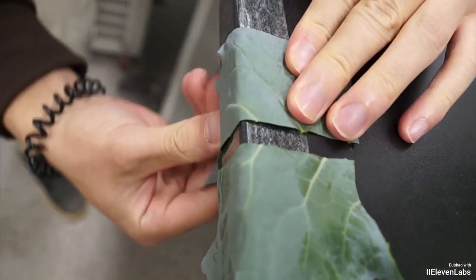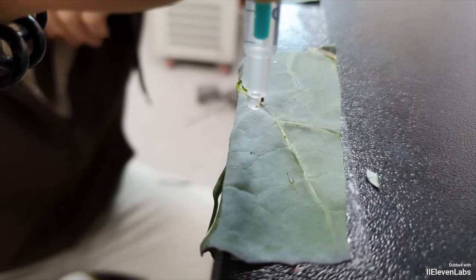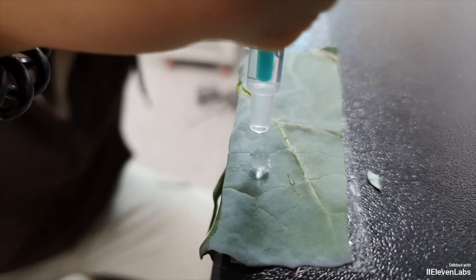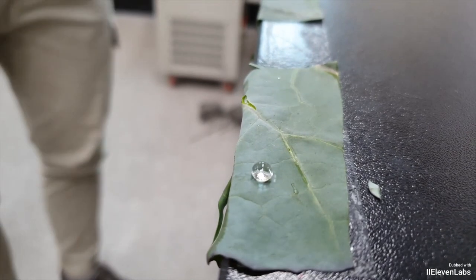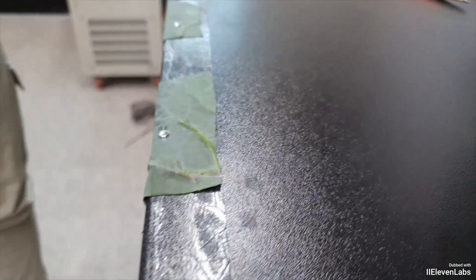When you drop water using a syringe, releasing it slowly from one centimeter above will allow you to create evenly sized droplets. Repeat the experimental method on at least three broccoli leaves to ensure reliable results.